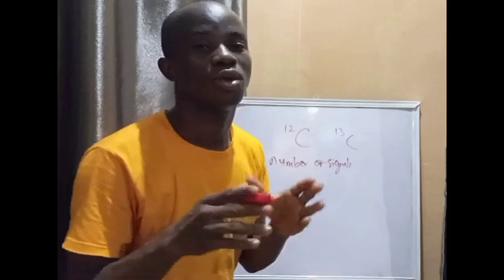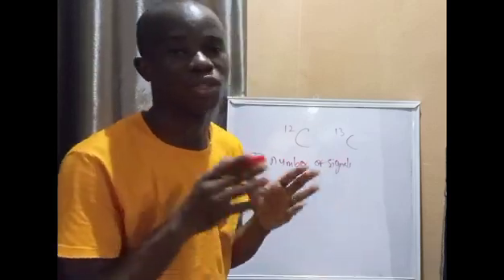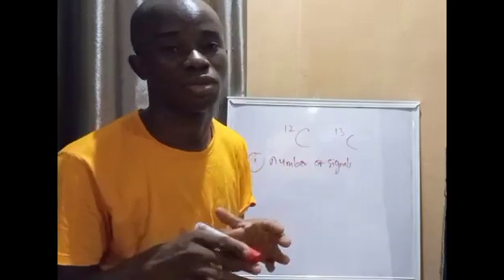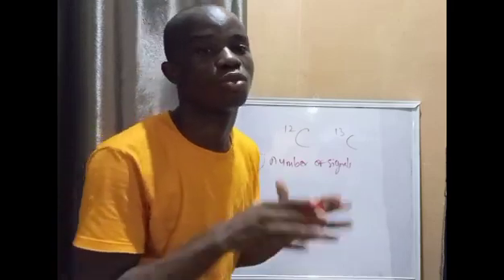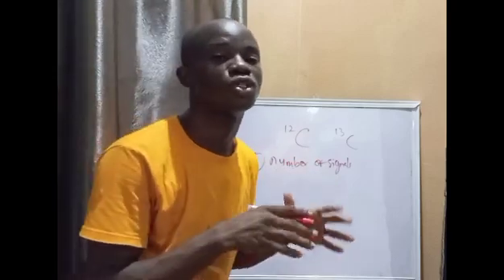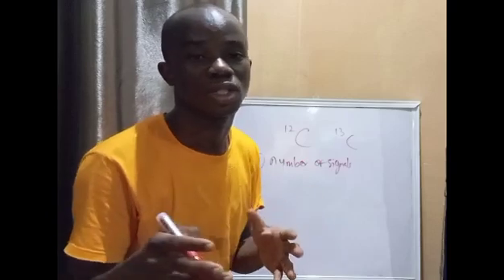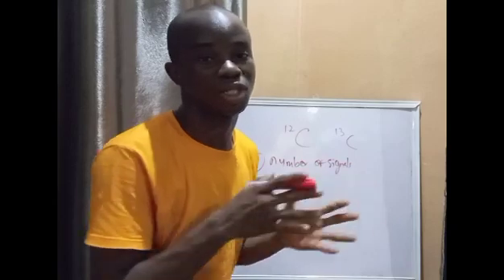The second thing you have to consider is the chemical shift. Like I said, the horizontal axis of the NMR spectrum indicates the chemical shift. So each of these signals in an NMR spectrum has its own chemical shift. And the implication of chemical shift most times is to tell us about the chemical environment of the protons generating each signal.